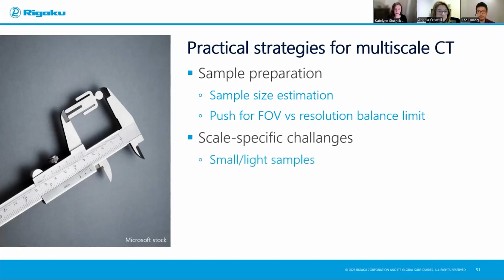And then we'll talk about some more scale-specific challenges. Like if I'm mostly focusing on lighter, small materials, what are the things I'll face most often? Specifically some of the challenges you will face more often than people who are not focusing on smaller and lighter materials. And also on the other side of the spectrum, the larger, heavier samples, the challenges you're going to face when you mostly scan samples like that.